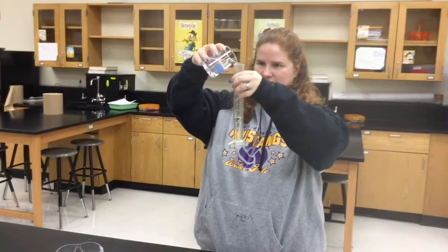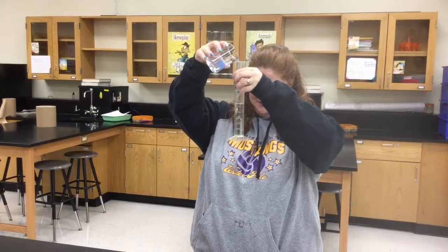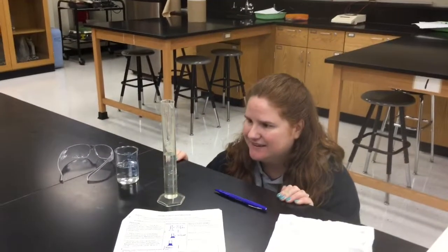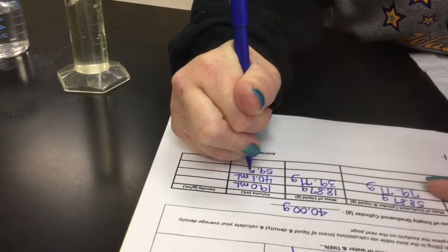More water. I'm trying to get it exactly every 20. It's hard. Oh, it's 59.5. I'm gonna trust you. Are you? Yeah, I'm gonna trust you. I think we should trust her. You can trust me. I mean, look at this face. Okay. All right, so what did you say? 59.5 milliliters. Okay. And mass.